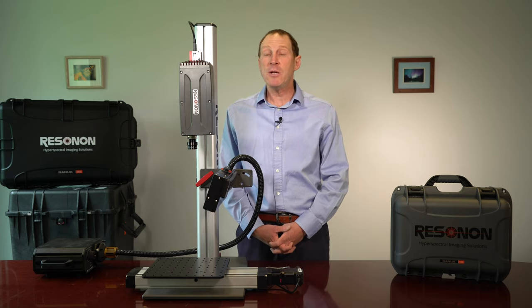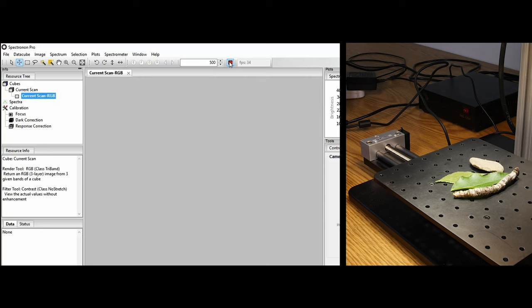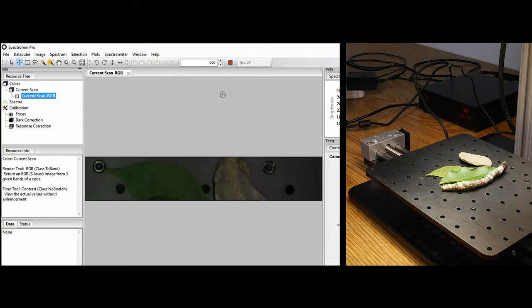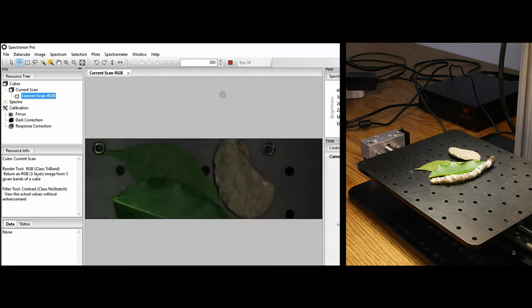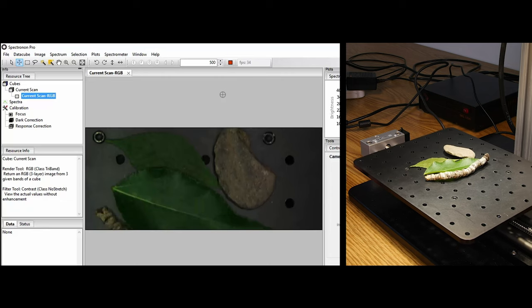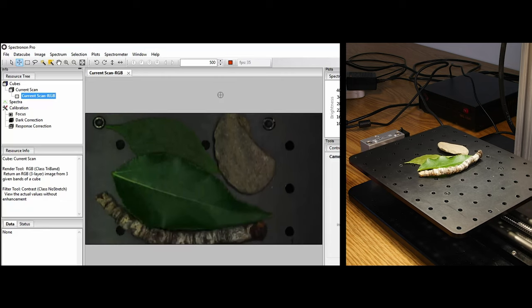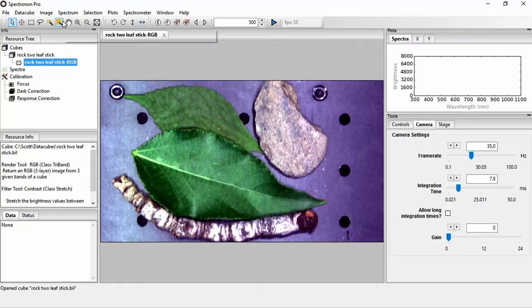Note that our hyperspectral cameras are line scan push-broom imagers, where each camera frame is a single line of data and a full two-dimensional image is produced by translating the sample underneath the camera and then stacking the lines next to each other.